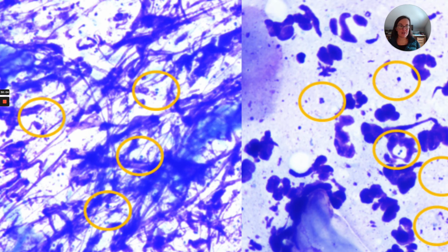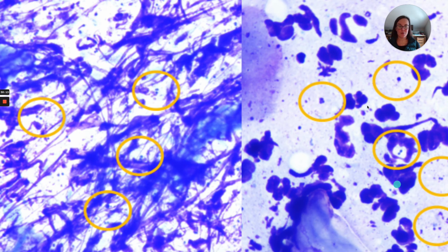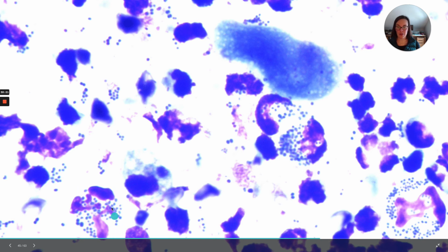And then here you can see these are some examples. This is a ton of neutrophilic streaming, which is very important to document. And then you also want to identify the predominant type of infection. And in this case, it's a staphylococcal infection. Now, this is a cool slide because you can see that this is a neutrophil and there's a lot of bacteria present within the neutrophil.